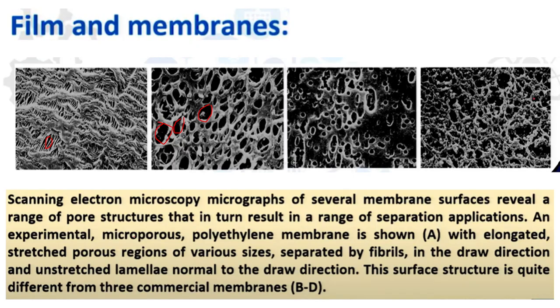So this is microporous polyethylene membrane, with elongated stretched porous regions of various size separated by fibrils. So if you stretch it, how the pores are oriented, the direction or the orientation of these pores with stretching, that you can visualize through the SEM.